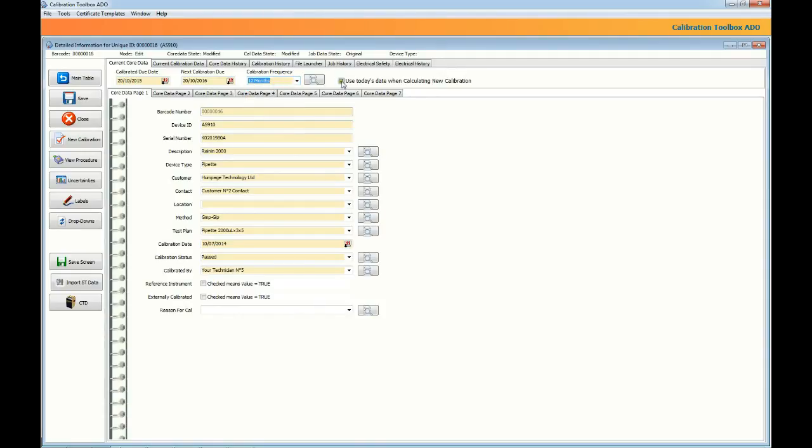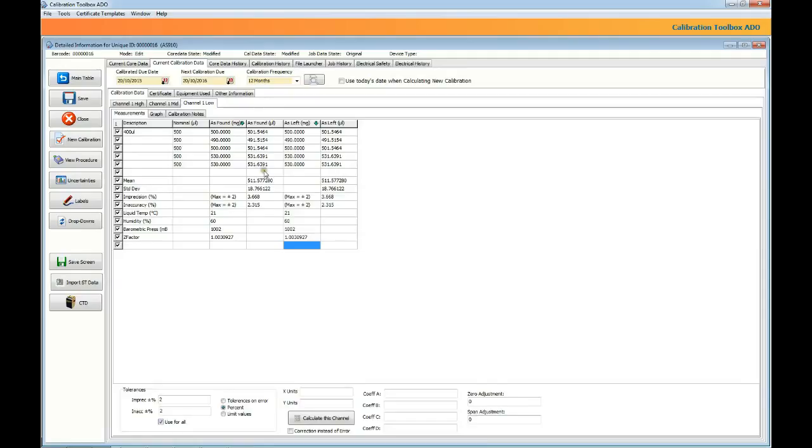And you generate these. Basically the system is a number of days followed by month will automatically generate a prompt. So if you wanted to turn that prompt off, remove that check.